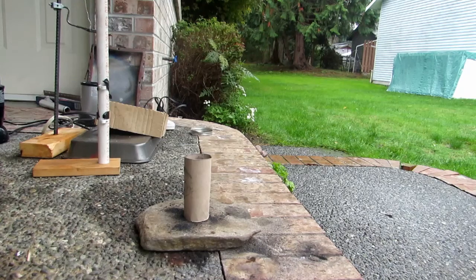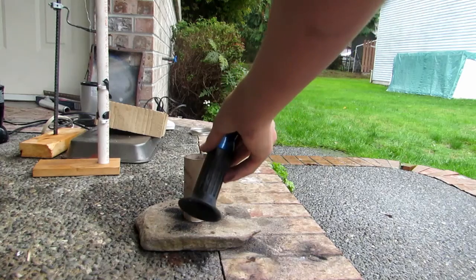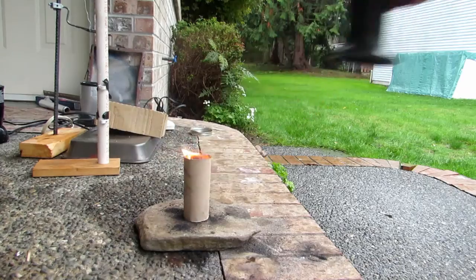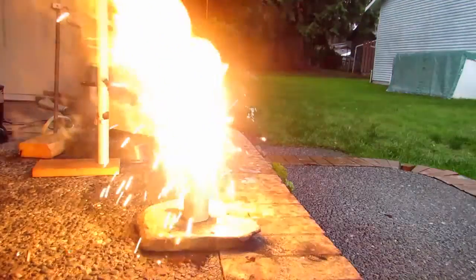I'll go ahead and light it and see if we can get a vigorous reaction. It should be vigorous but not so vigorous that it's going to horribly affect our reaction. That's burning — and there we go.